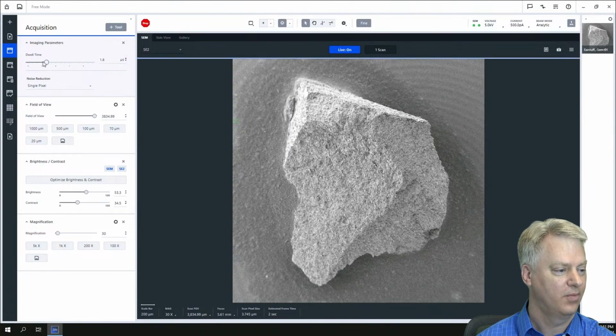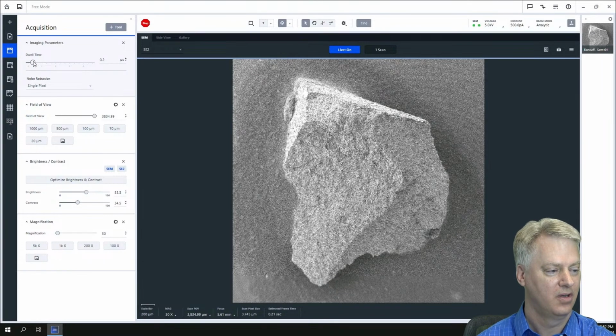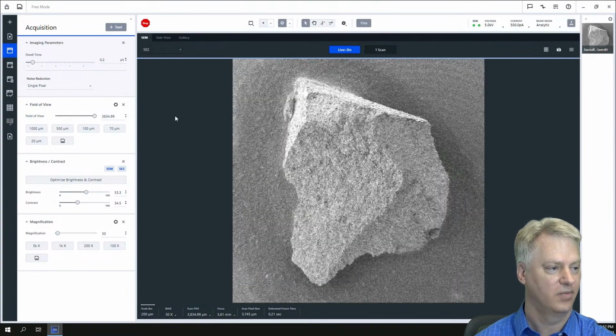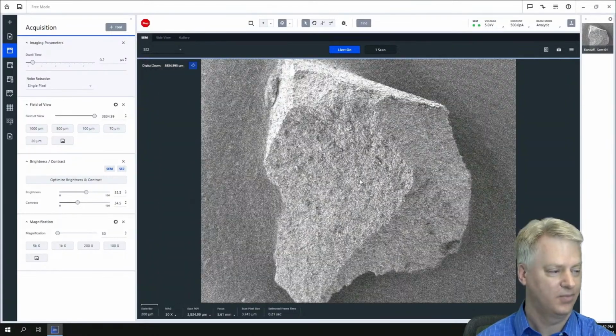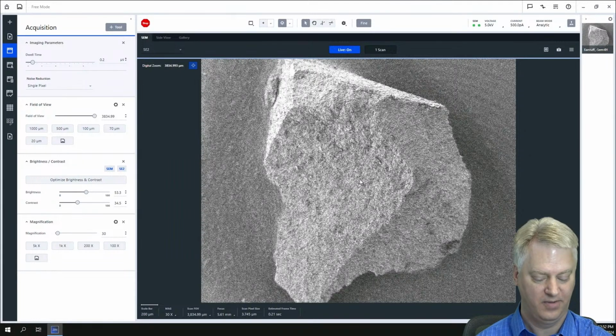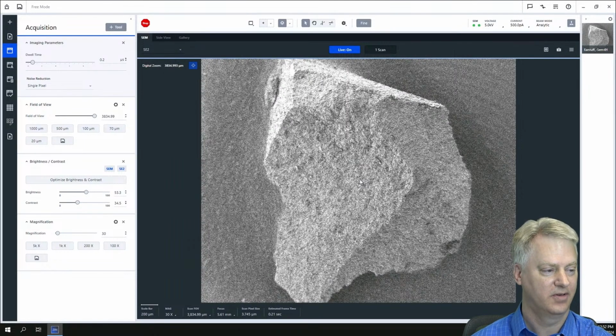At this point, I've opened up the ZenConnect workbench, and it has all the workbenches on the far left along the left tab. It's in the acquisition workbench. I have it set up on our iHR SEM, and this particular sample is a fractured neodymium magnet that's been demagnetized. The nice thing about this is that it handles different kVs and different currents really well and behaves nicely, so it demonstrates nicely what we're trying to show today.